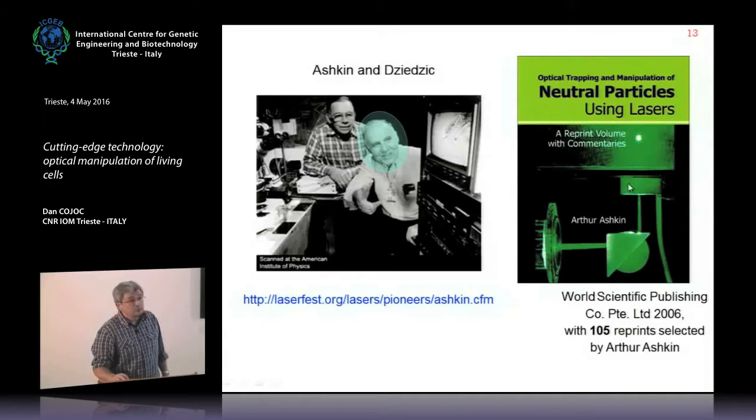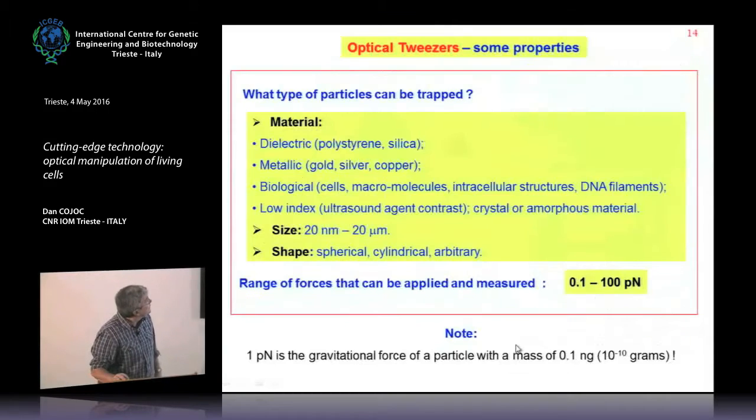What is more difficult to see is this piezoelectric ceramic, which at the beginning shakes the sample to detach the particle from this surface, because the forces are van der Waals and they are small, nanonewton, but the forces to maintain the particle in equilibrium in levitation here are piconewton. So the laser is not able to detach the particles from the surface. You need something else, but once the particles are detached, they levitate, so I think it's a beautiful cover as well.